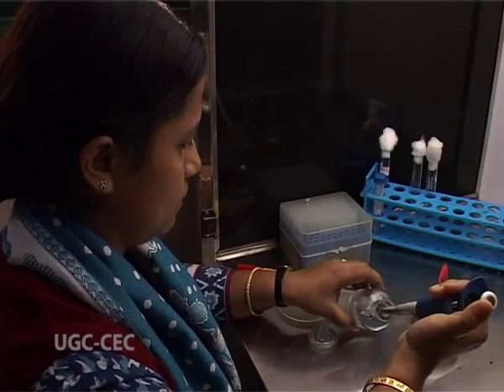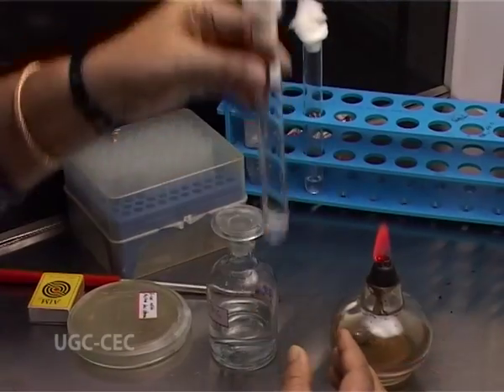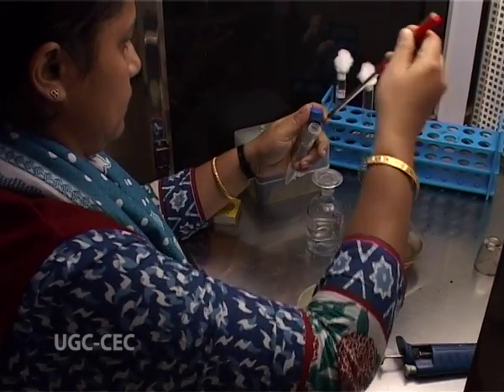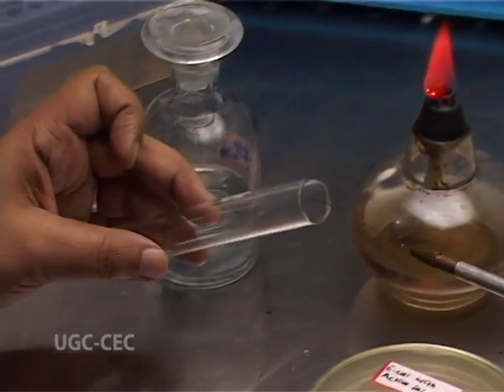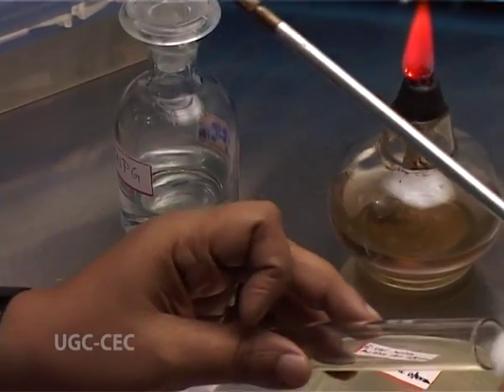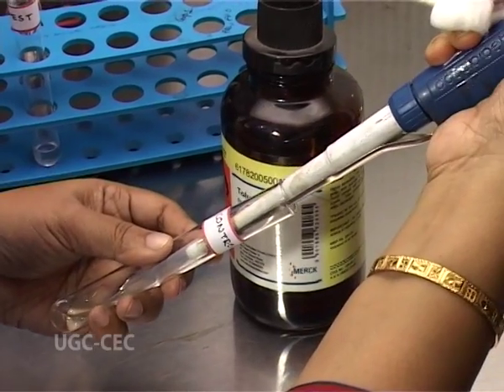Now let's have a look at the qualitative method of estimating the expression of beta-galactosidase. Here, first we will take 2 ml of ONPG in 2 different tubes. After that, a loopful of bacteria is taken aseptically from the plate. It is added onto the solution containing ONPG, and it has to be twiddled properly so that the bacteria get dispersed into the ONPG. After that, we will be adding a drop of methyl benzene to each of the tubes, right?